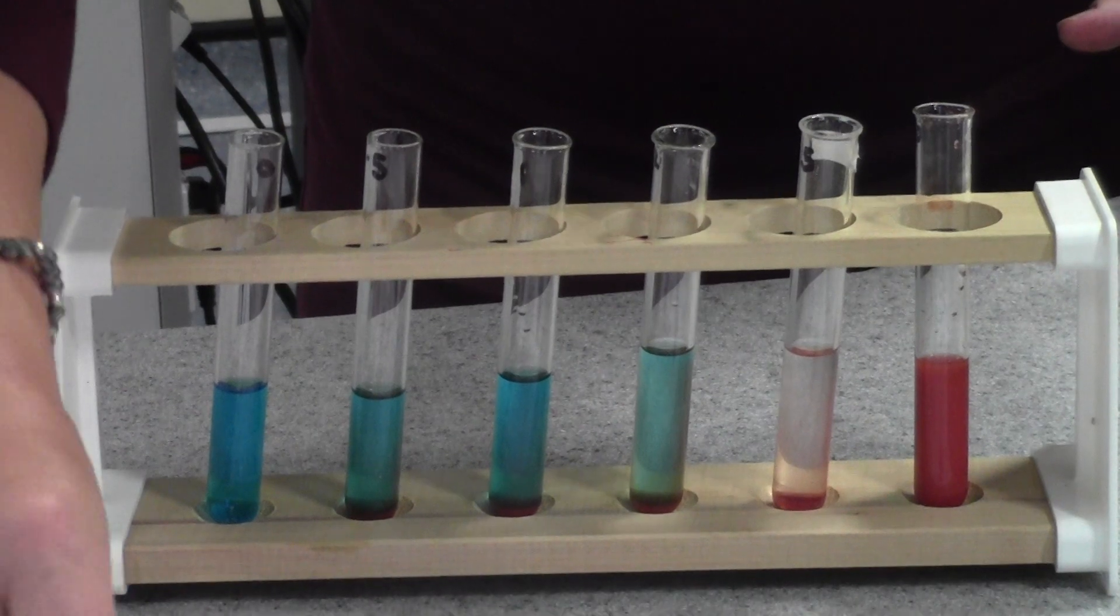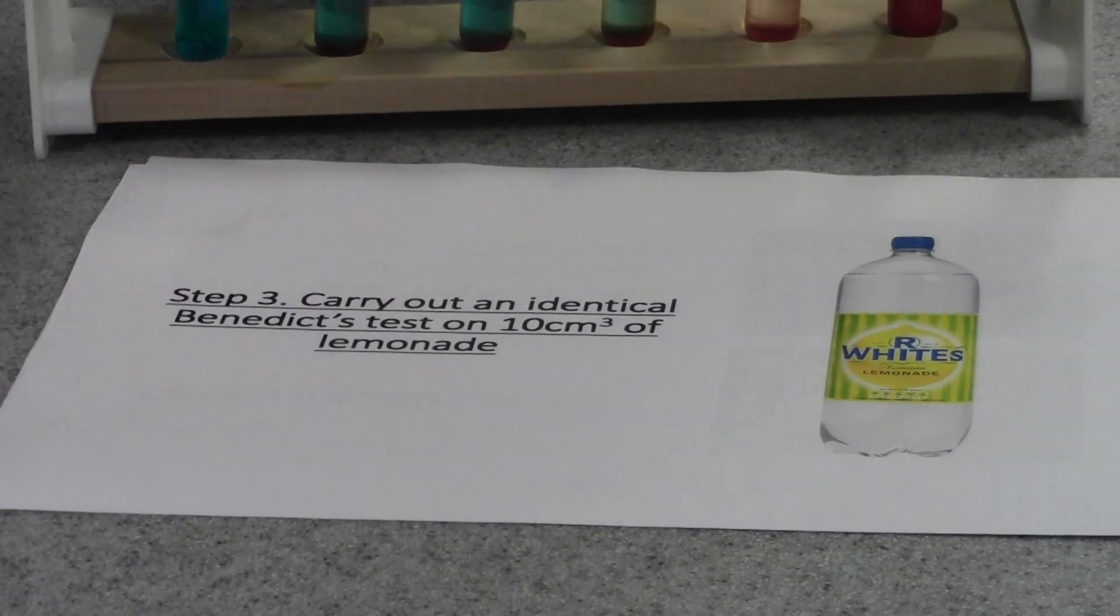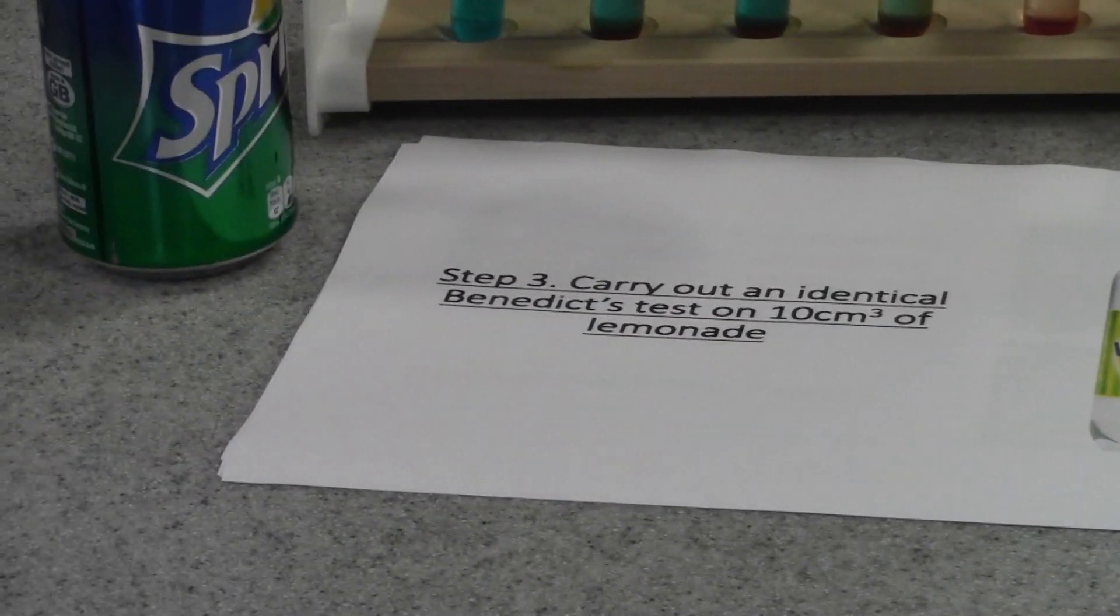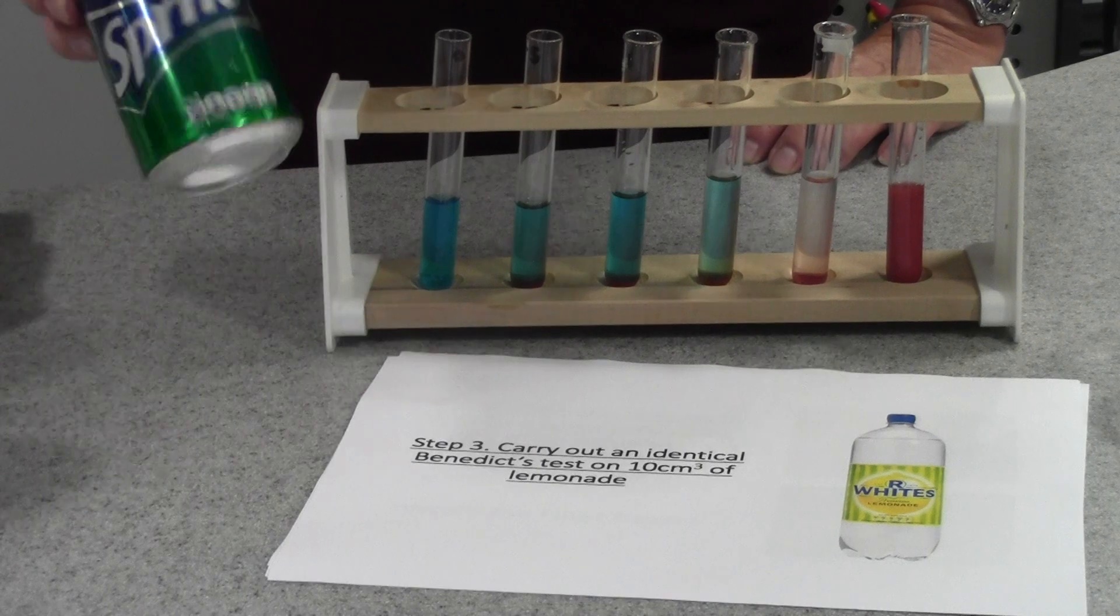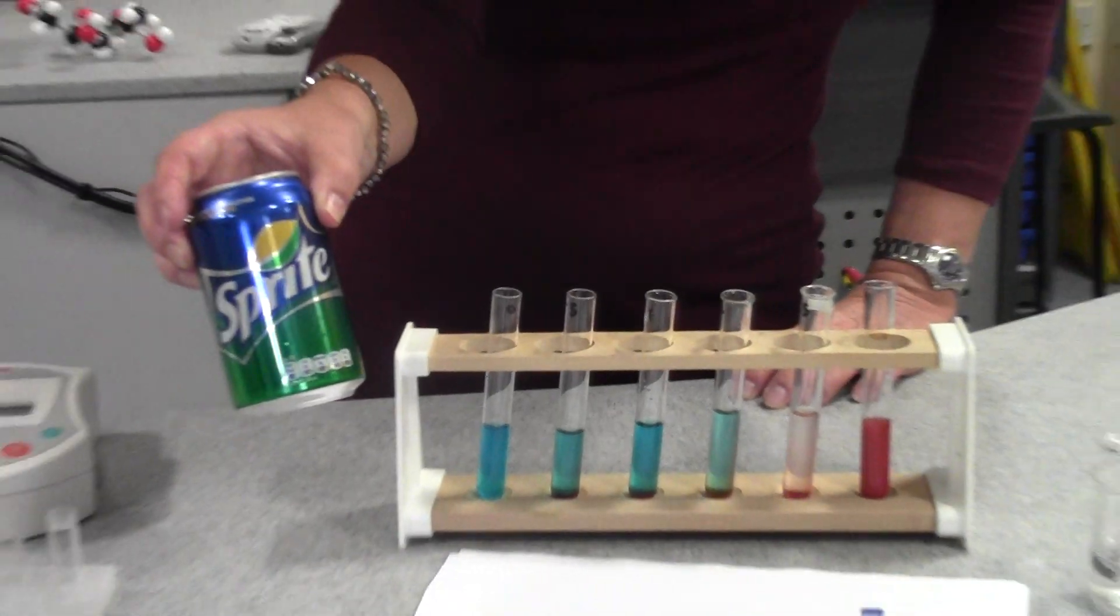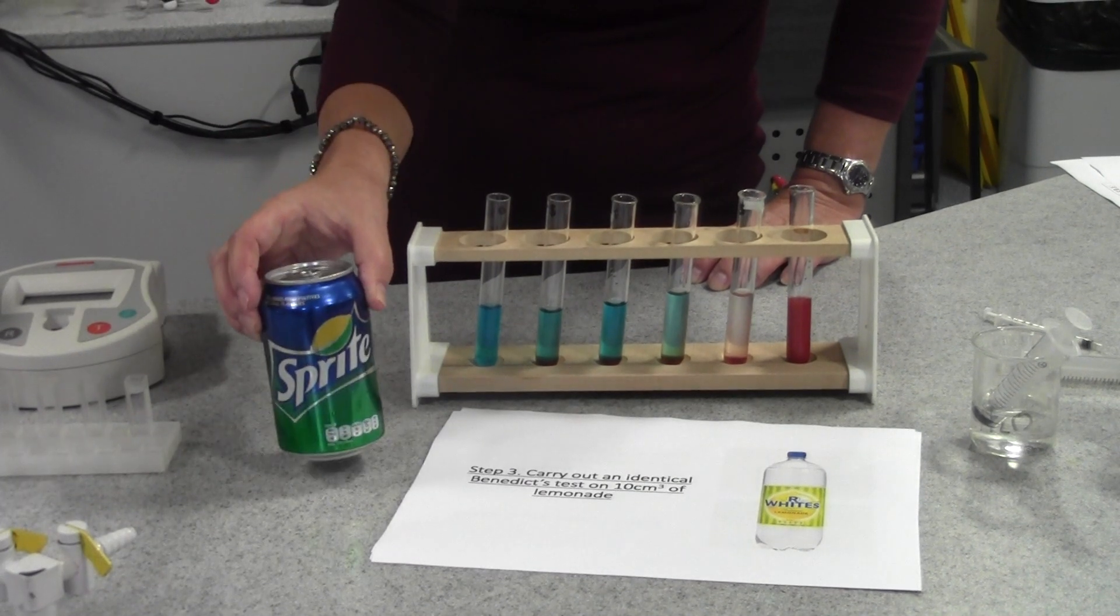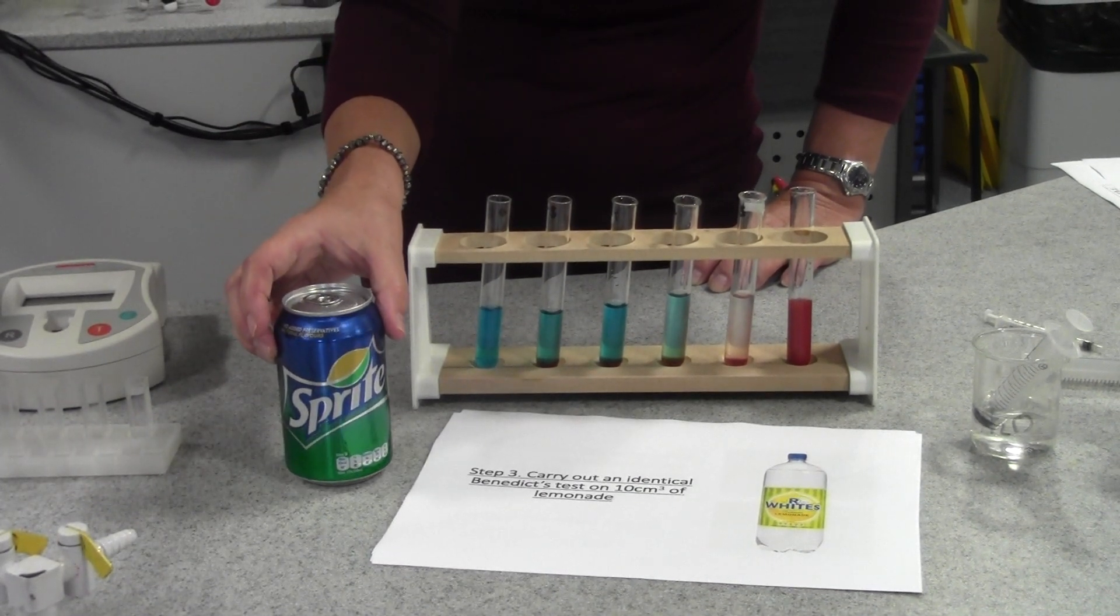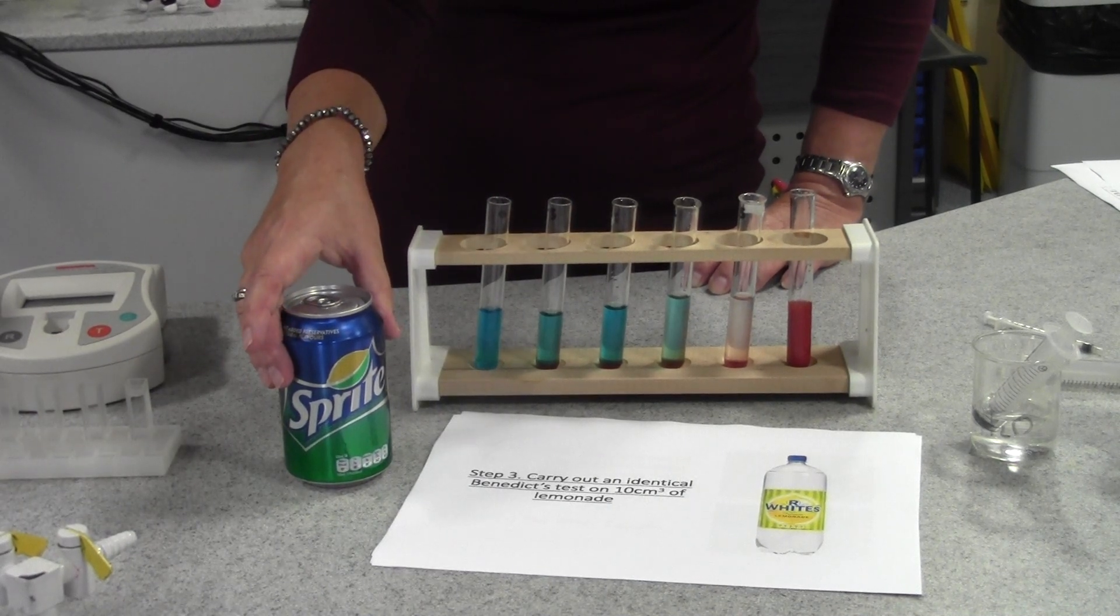As well as testing the standard glucose solutions, you also need to carry out an identical Benedict's test using 1 centimeter cubed of your drink—and do make sure you don't use sugar-free. So 1 centimeter cubed of that, again with 5 centimeters cubed of Benedict's solution, in a water bath at 90 degrees Celsius for 5 minutes for the reaction to take place.